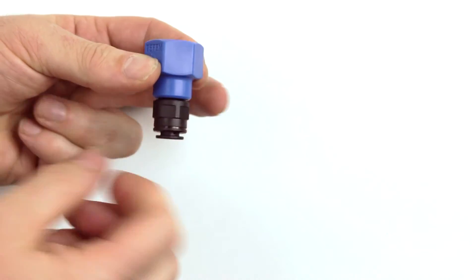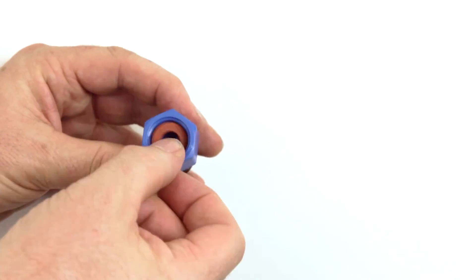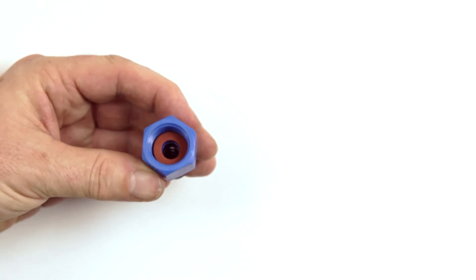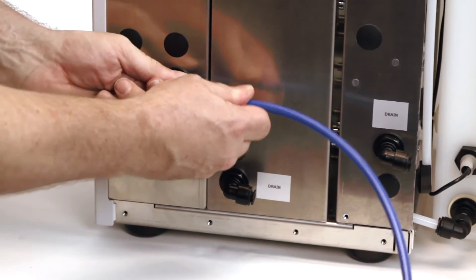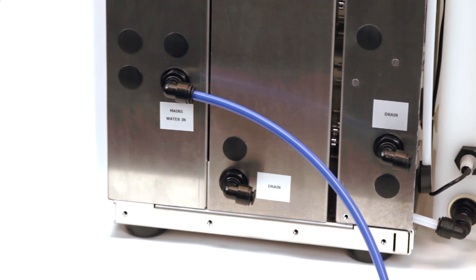Using the adapters provided, convert the purified water supply to 8mm. Connect to the inlet using the 8mm tube provided. If fed from a purified water distribution system, a pressure regulator is provided to reduce the pressure down to one bar.